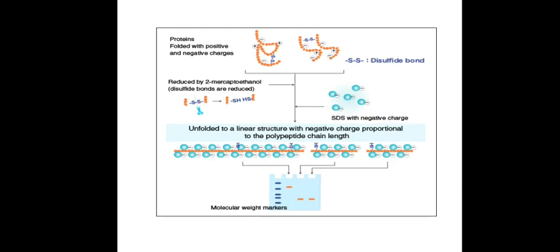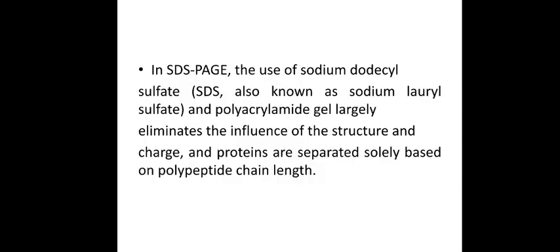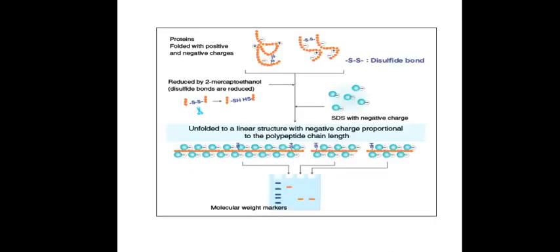Whereas when you use SDS, as I said, this is a detergent, sodium dodecyl sulfate. So this is a detergent, and it will denature the protein, so that you are going to get a linear chain of a polypeptide chain. Disulfide linkages and all are broken.